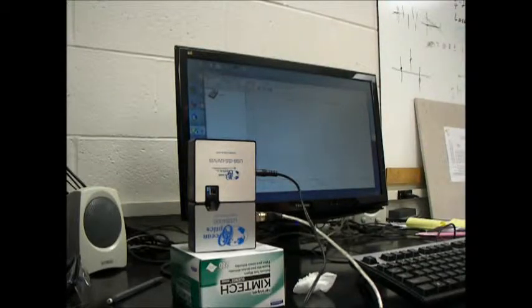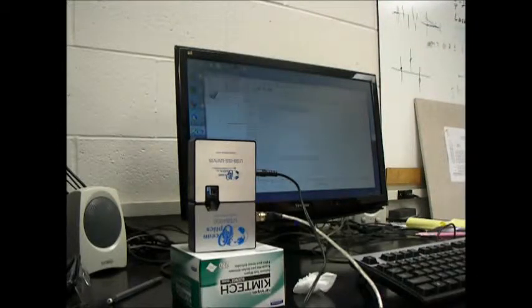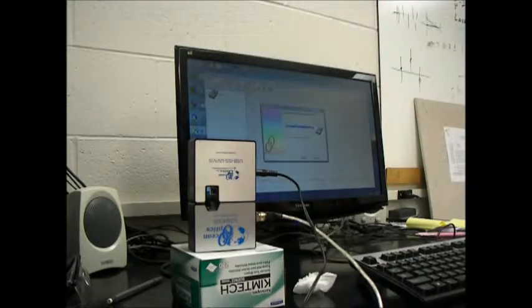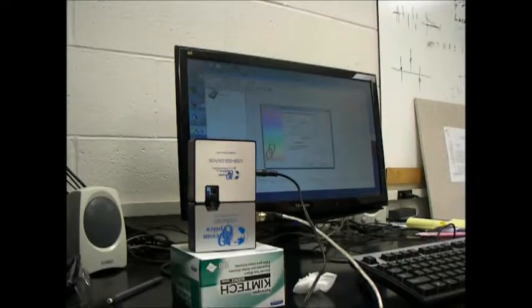Now to calibrate, do File, New, Absorption Measurement. Choose the device and click Next.